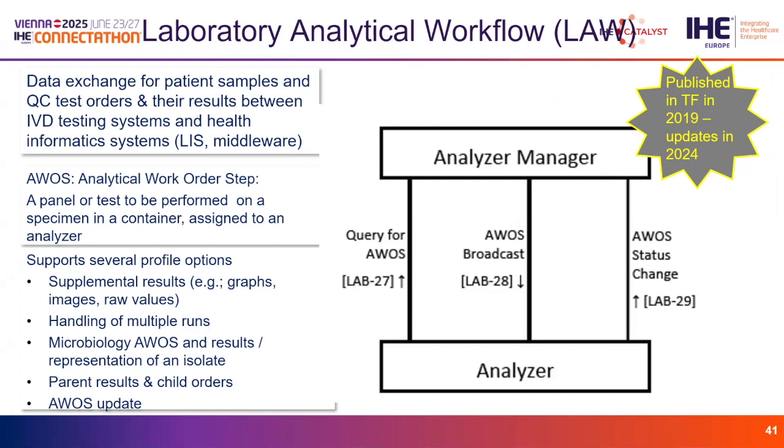And also the analyzer obviously is responsible to send some status changes on the analytical work order steps once, for example, it executes some battery of tests on a specimen, to send the results. There are also some options in the profiles that cover some specific operations, as for example, reruns on the analyzer or reflex tests. Next slide, please.